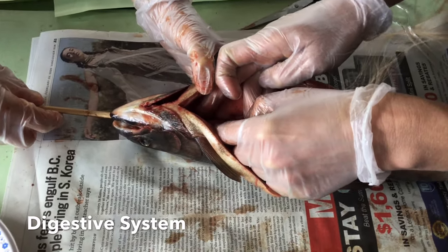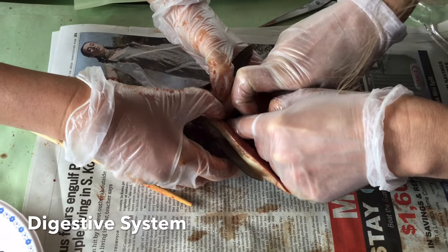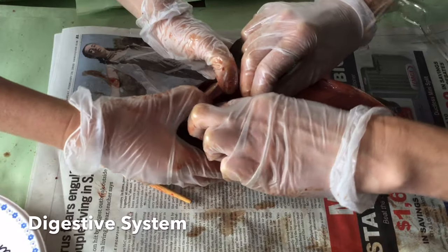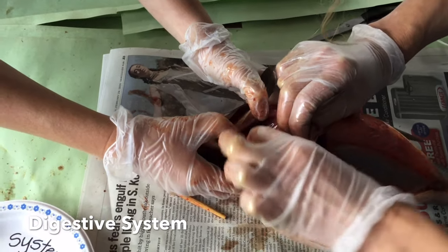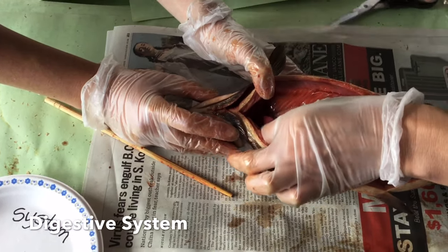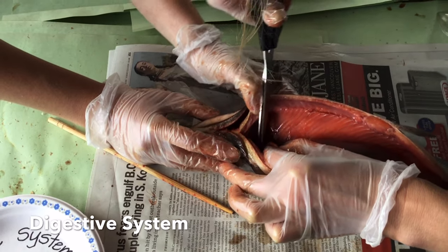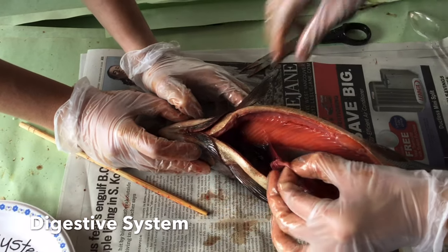So you're just kind of detaching at the throat there, up in this membrane here? Yeah, you can kind of just pull it out wherever, and then tease away the sides. Am I going to break the top though? Because it's attached to the mouth, right? How am I detaching? I cut it. Oh, you cut it. Like in here. Yeah, it doesn't matter how high up, I don't think. Delicate operation, getting that digestive system out. The rest kind of falls away.